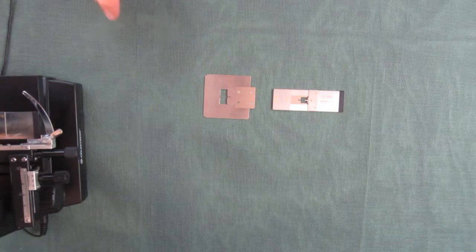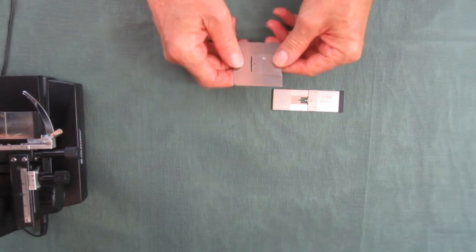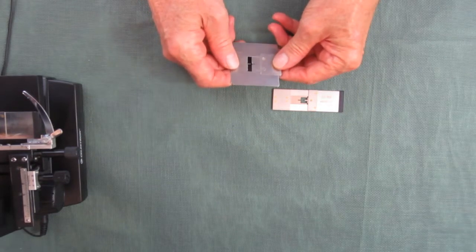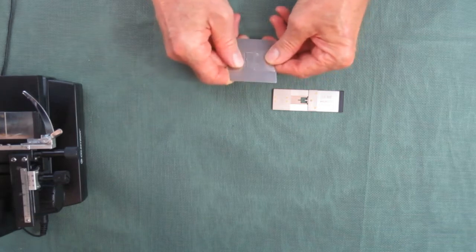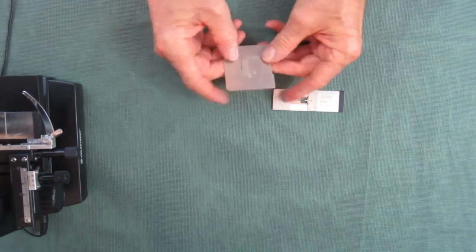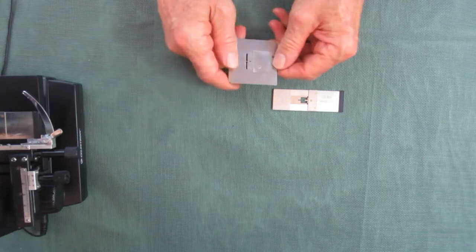So this is the old plate, the ones I used to sell. I stopped selling them a number of years ago and I was never real happy with them, but people wanted them so I made them and sold them.